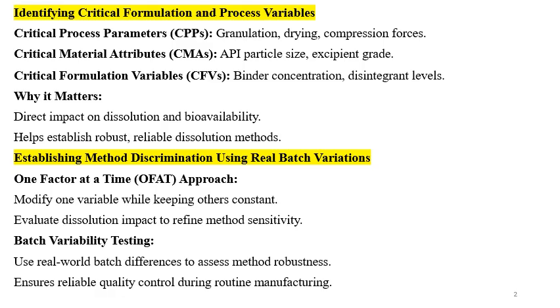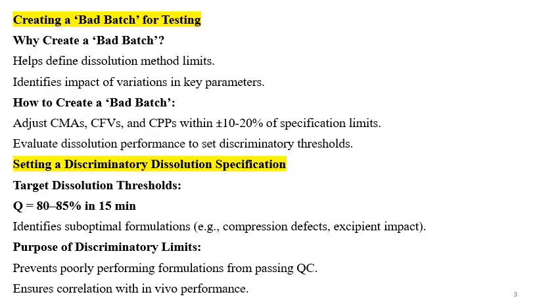Understand that the dissolution specifications are based onto the bioequivalence batch. There are some guidelines which provide you the references for deriving the dissolution specifications, and the bio batch, clinical batch dissolution should be considered as a reference for making the discrimination and also for making the dissolution specifications.